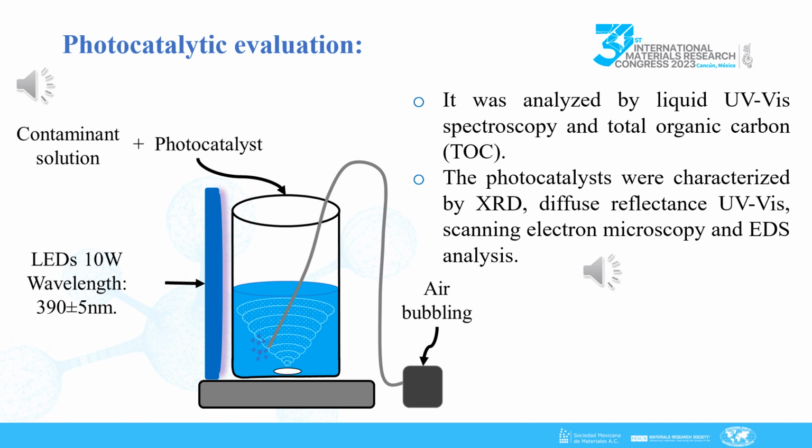It has 10-watt LEDs with a wavelength around 390 nanometers. The solution was analyzed by ultraviolet visible liquid spectroscopy and total organic carbon.